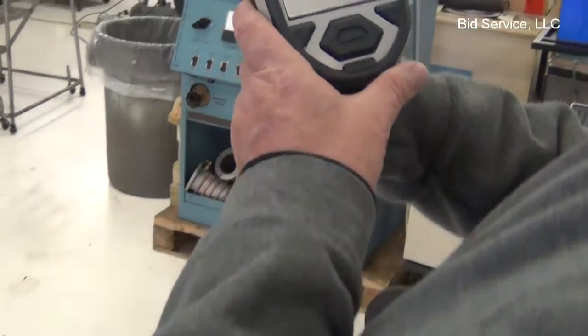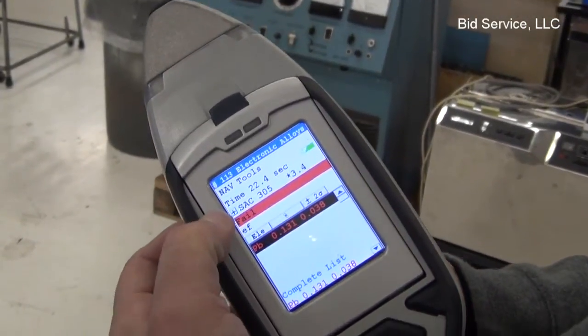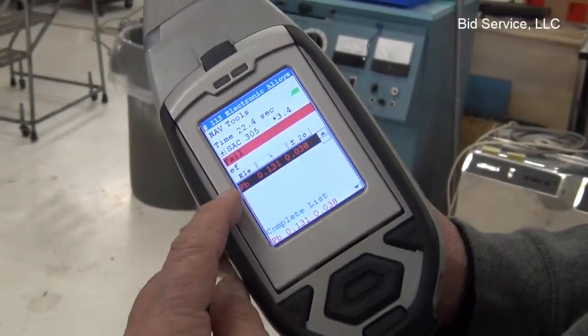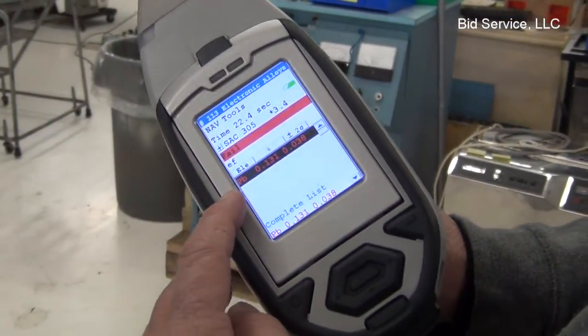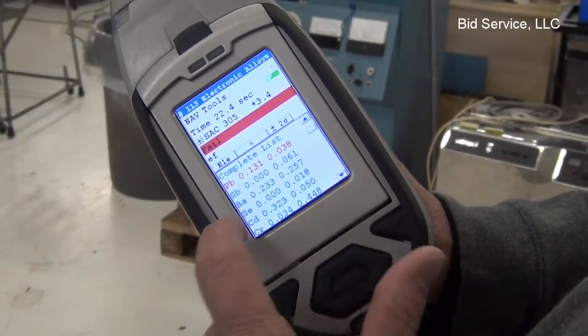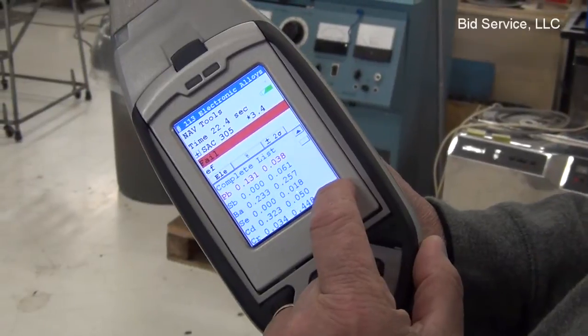The reading has completed. The 'fail' is not an indication that there's a problem — it's just related to the testing involved. It shows you immediately the amount of lead on this particular test. And if we scroll down, it will go through all the different elements and show you the percentage of the material it detected.